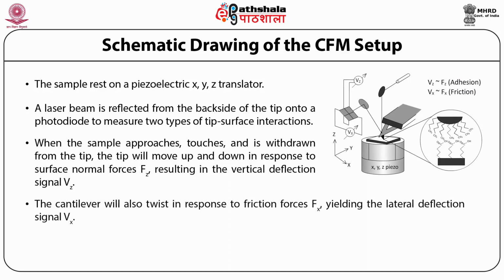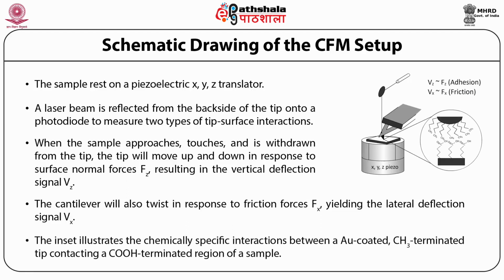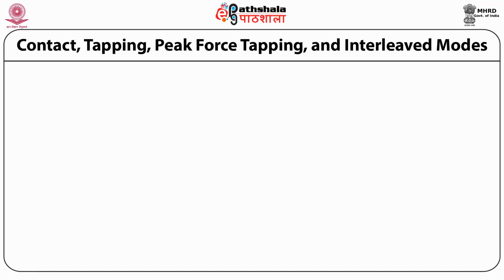The cantilever will twist in response to a frictional force, which we have designated as Fx, yielding the lateral deflection signal Vx. The inset illustrates the chemically specific interactions between a gold-coated CH3 terminated tip and a sample containing an acid terminated region.